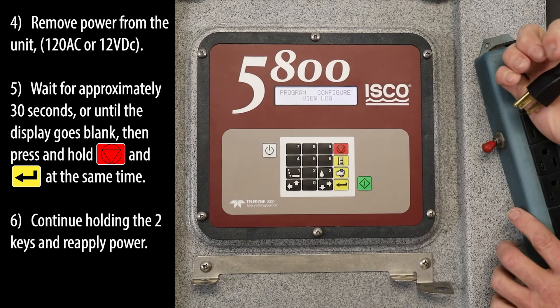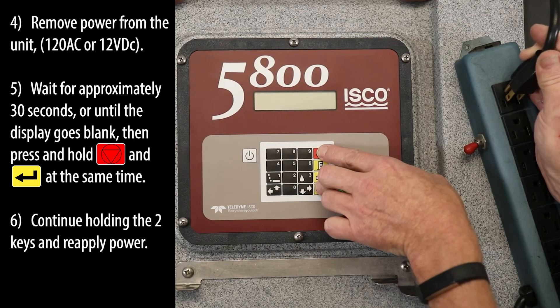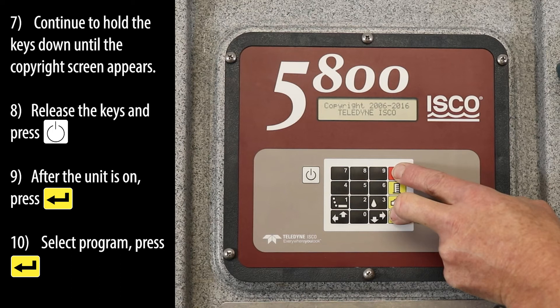Remove power from the unit. Wait for approximately 30 seconds or until the display goes blank, then press and hold the red stop and yellow enter keys at the same time. Continue holding the two keys and reapply power. Continue to hold the keys down until the copyright screen appears.